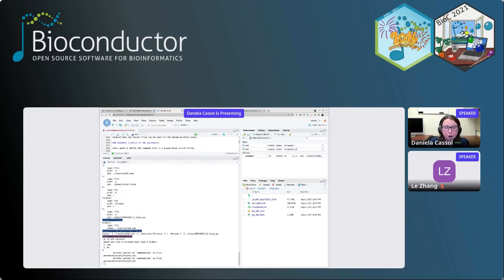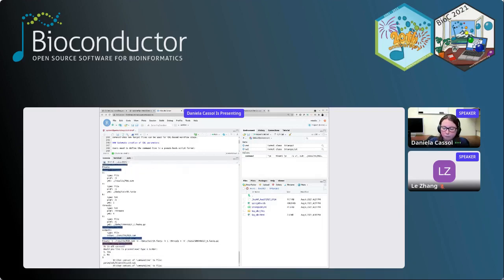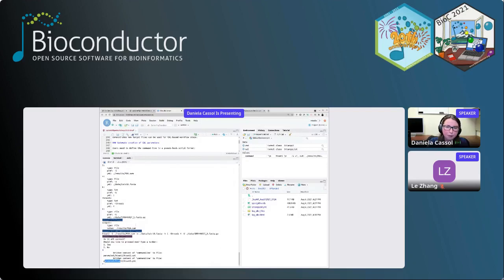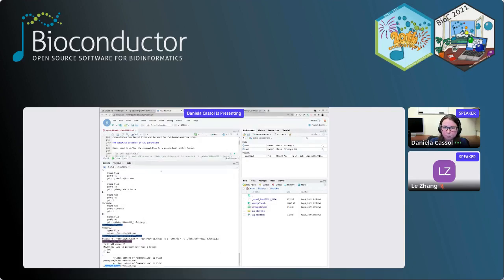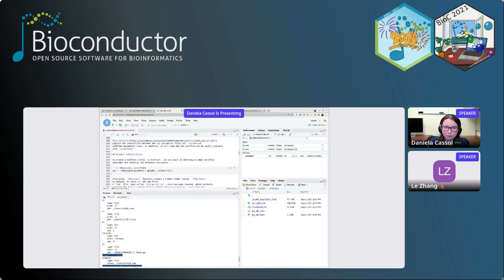All those CWL files are written in this specific folder, so now you can have access. Now we have created everything you need from the system for CWL, and then we can start to create our workflow. To do that, I'll jump a little bit down here to the project initialization. I'll discuss a little more detail about the SPR project.